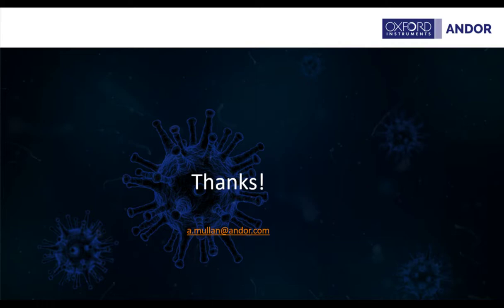So as far as how early we've imaged them, I have imaged them as early as 2 hours post-infection and imaged them out a couple of days on the spinning disk confocal, actually. Typically, we don't see replication centers forming until kind of mid-20-ish hours post-infection, but as I showed during the talk, at higher MOIs, we can push that up, and sometimes we see cells like 12 hours post-infection that have replication centers already. For the second part of the question, yes, we did use the human.